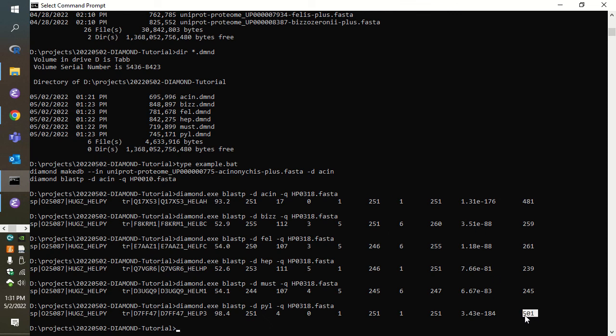Here we see that this last one scored 501 points and had an E value of 10 to the minus 184th power, and others produced slightly less good matches. Here we scored 239 points. Thought about on another level, in strain B8 we had a 98% identity between the two sequences, meaning that the amino acids were absolutely identical at 98.4% of the positions.